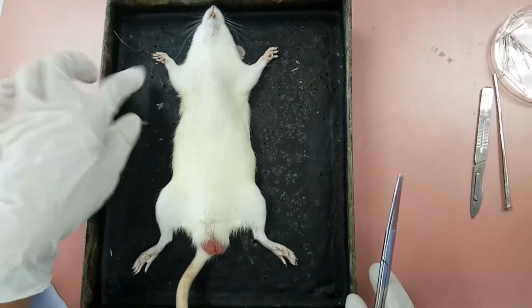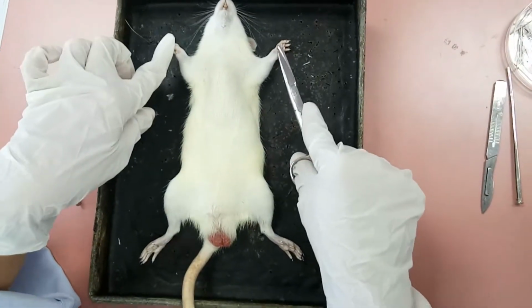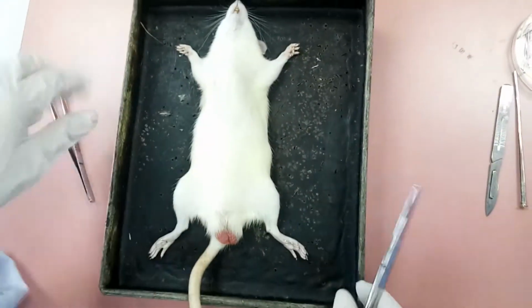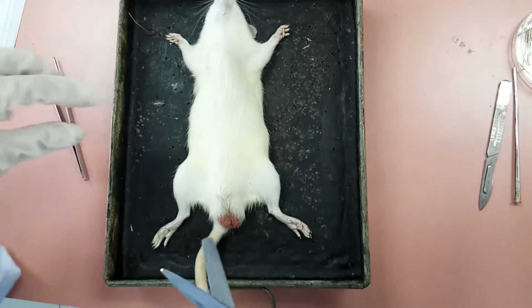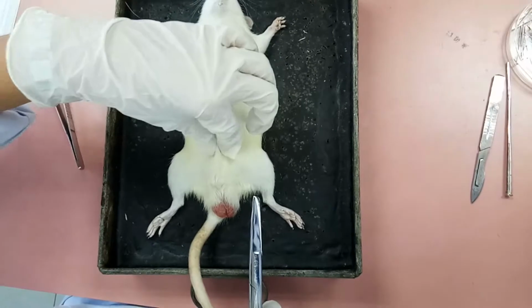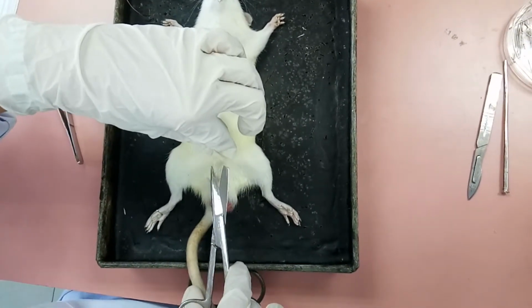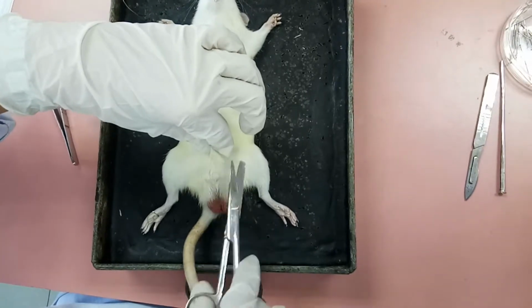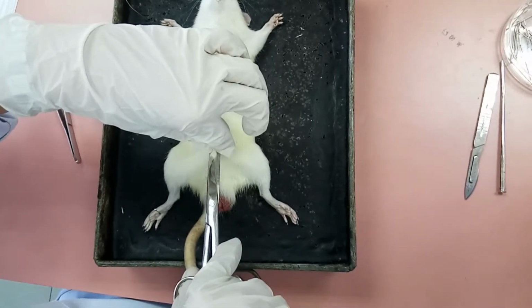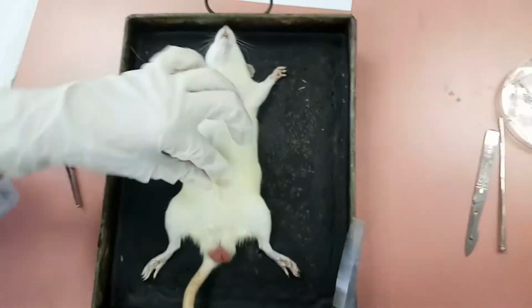Pinning, we pin the limbs of the rat here, 4 pins. Then we start to dissect. The skin, and below it, we make a small incision here.